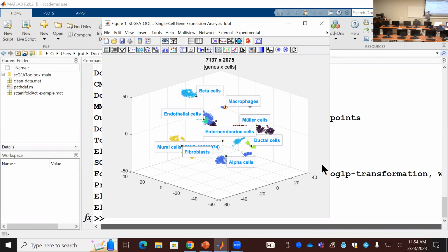It looks like this probably gave you some new cell types, because this further concentration of the same type of cells gives you a stronger signal. You can compare this with the t-SNE UMAP annotation. But anyway, these are options for you to explore, and let me know if this works better than others. Okay.